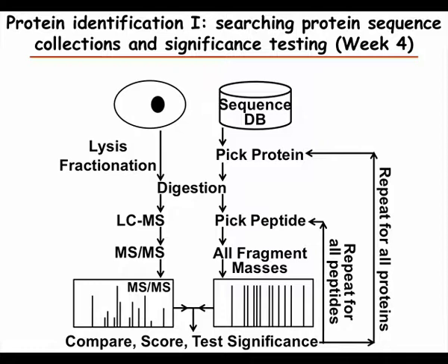But even then, the masses of different amino acids are quite similar, in the sense that they are only composed of a few atoms. So there are only a few different masses, and if you add in that there could be modifications too, there can be a lot of randomness to it.